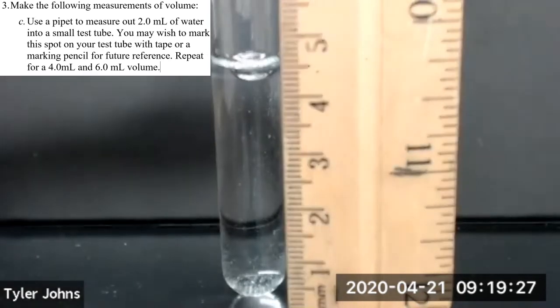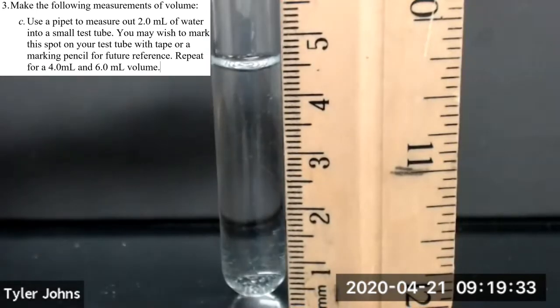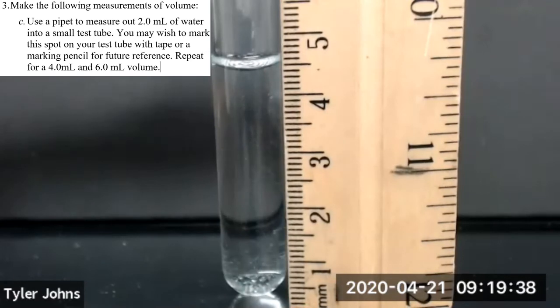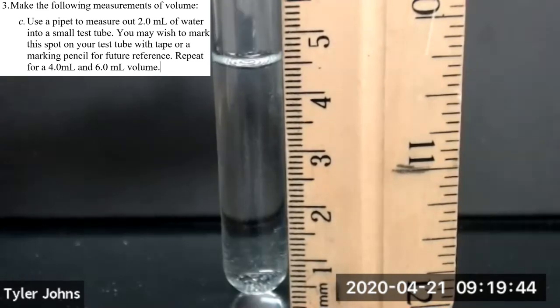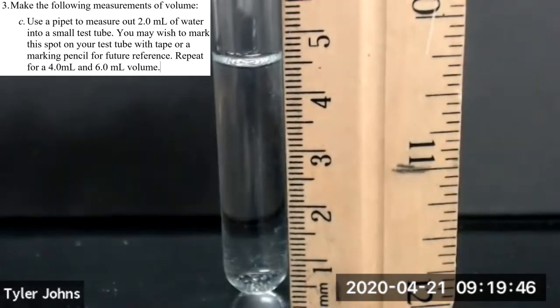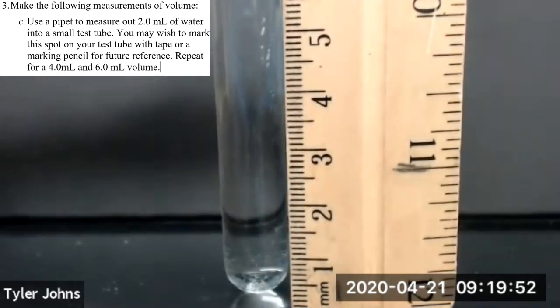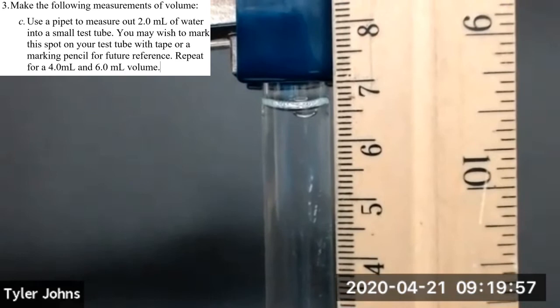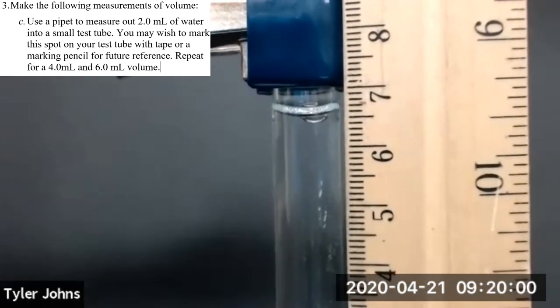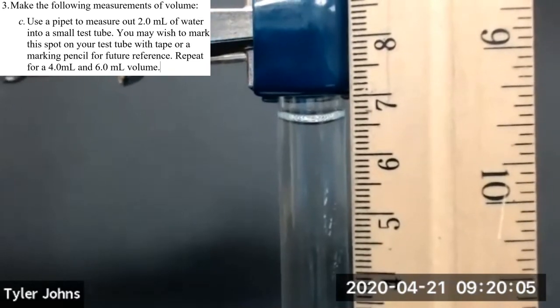So now we have a total of 4 milliliters of water. Get that bubble out of there. And now we're going to add our last 2 milliliters of water. Here's our last 2 milliliters of water. And there's the volume on our last 2 milliliters of water and the length of the test tube that we used.